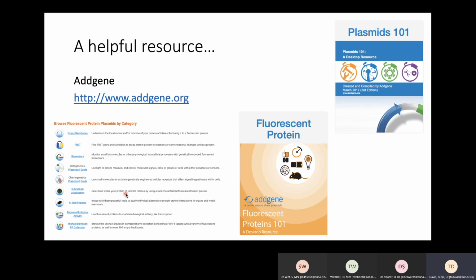And so lastly, I just thought I'd share somewhere where I actually learned a lot from working with plasmids, a website called Addgene. It's actually a non-profit organization where they collect plasmids from researchers all around the world, and then they share them, and you can actually buy them, available to buy from anyone.